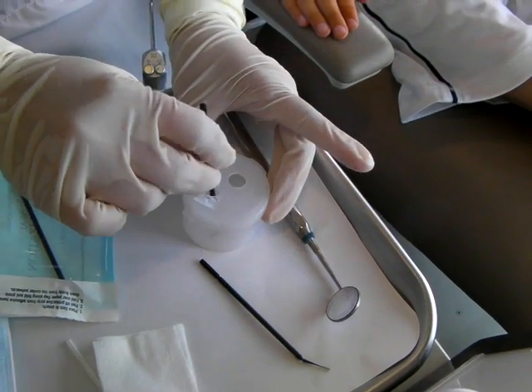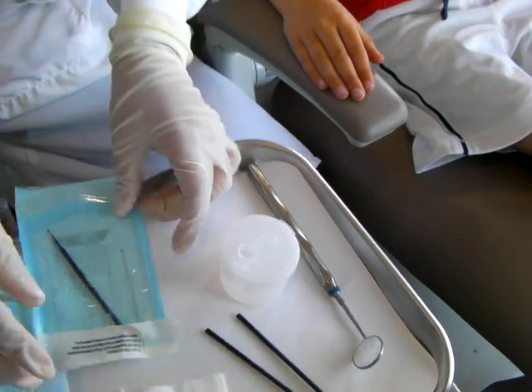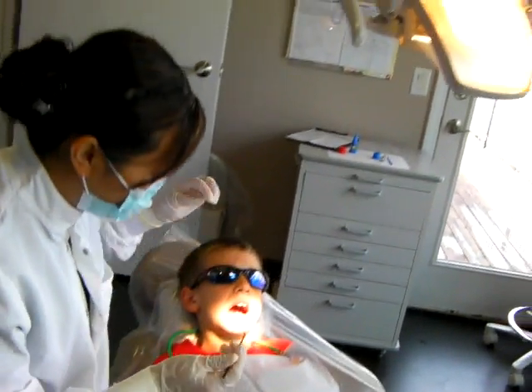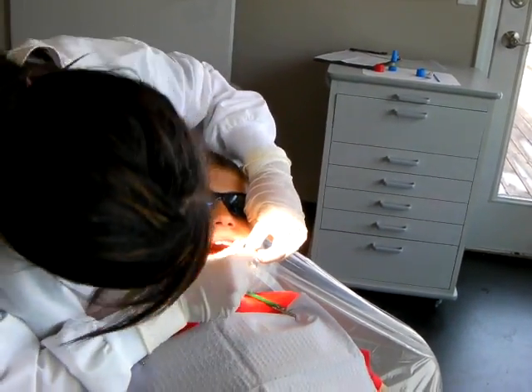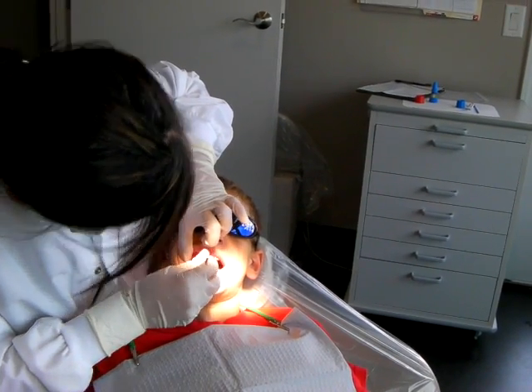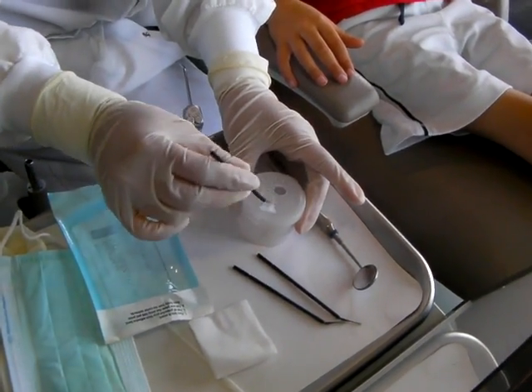spin it around and then you're going to take the last sterile micro brush and you're going to swab the occlusal surfaces of all the teeth. Put it back in the buffering solution, spin it around and that's it.